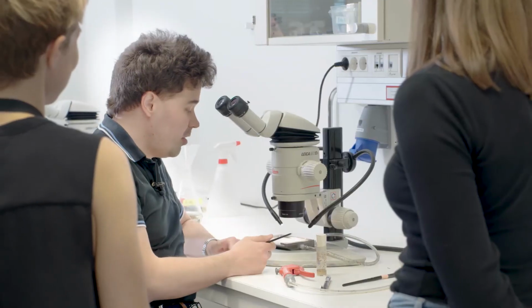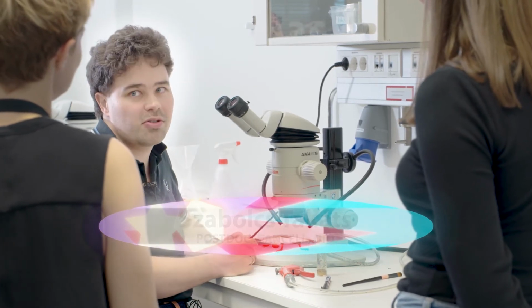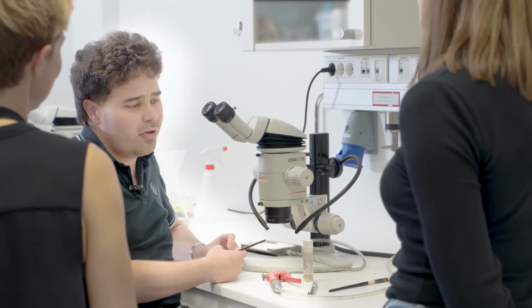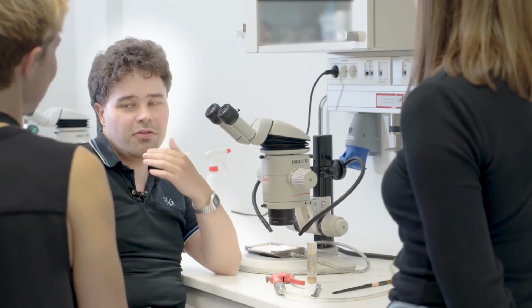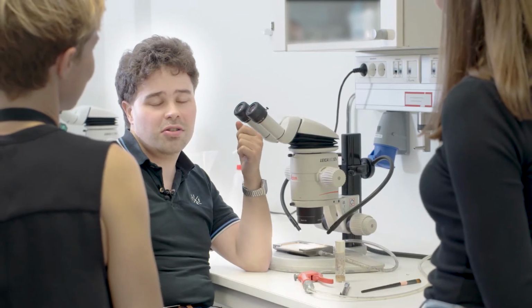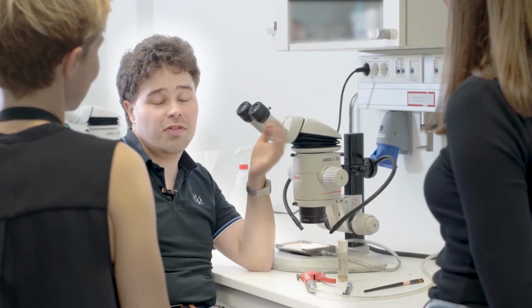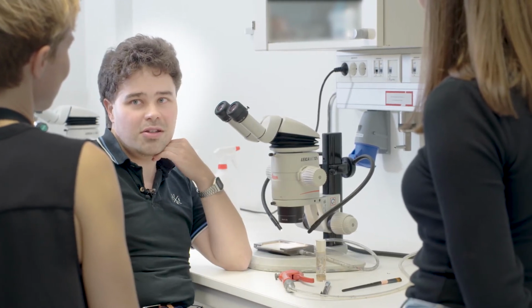Hi, Sabi. Hi, guys. What are you doing? I'm just collecting some virgins. I want to do a new experiment and I need to set up new crosses. So you've been working with Drosophila for some time. Can you tell us a bit about your favorite aspects of the model organism? Sure. I have been working with flies for more than 10 years. And I think the best thing with flies is that you can combine the classical genetic approaches with modern molecular genetics or cell biology or even physiological techniques. And it's relatively easy to combine these things.